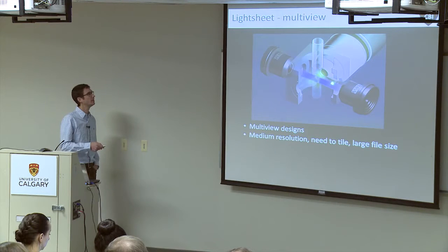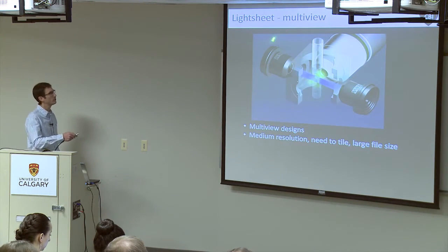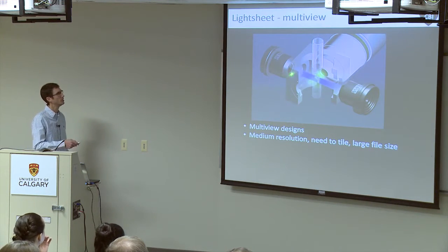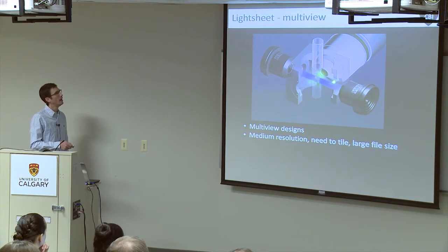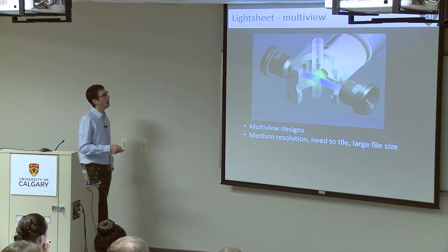Essentially you have a cylindrical lens further back in the microscope that forms your light sheet. You use some low NA spherical objectives just to focus that a little bit more into your sample. And you make this nice thin light sheet that you can then move your sample back and forth through while you collect fluorescence on this imaging objective at the back.